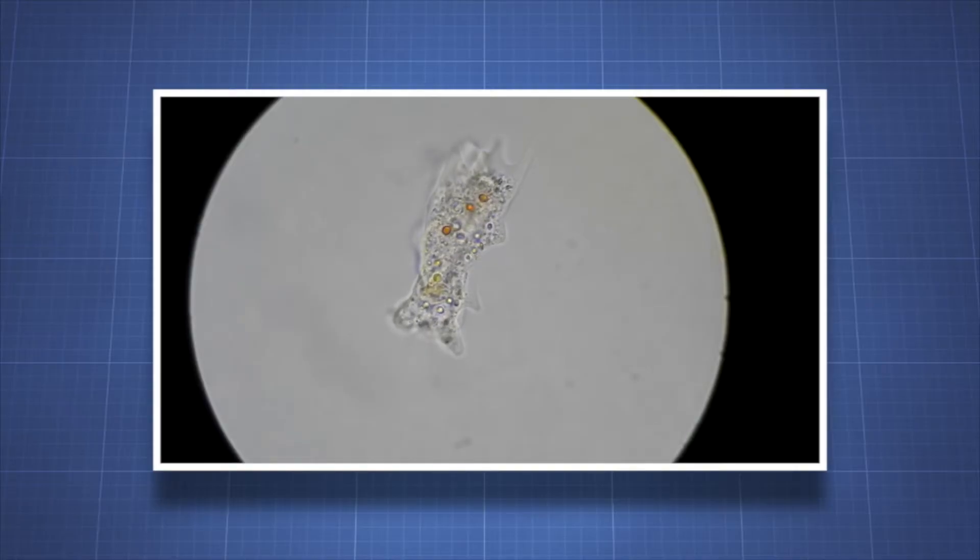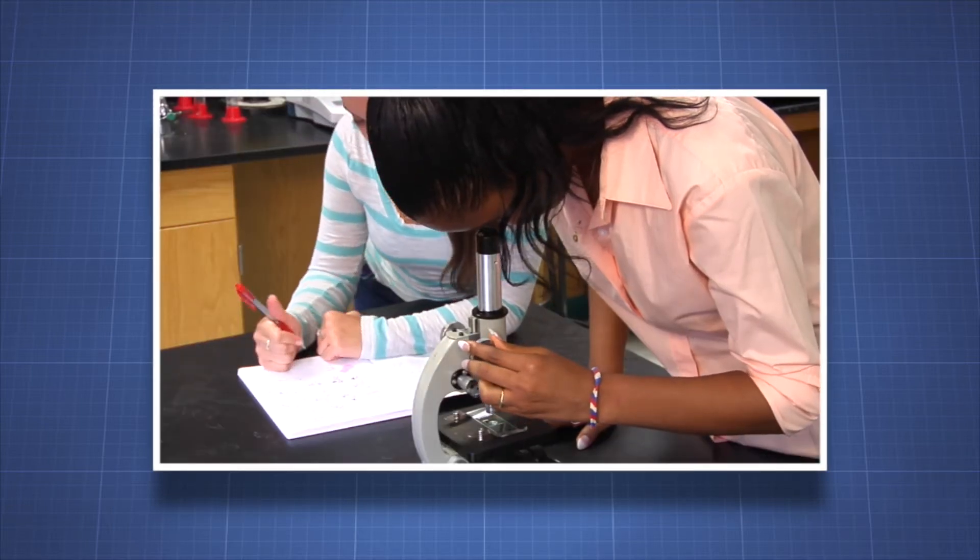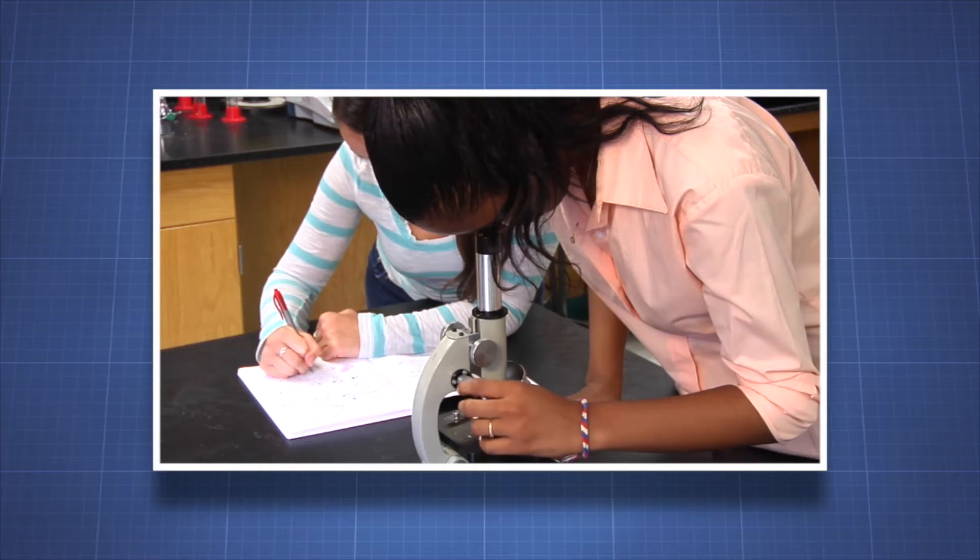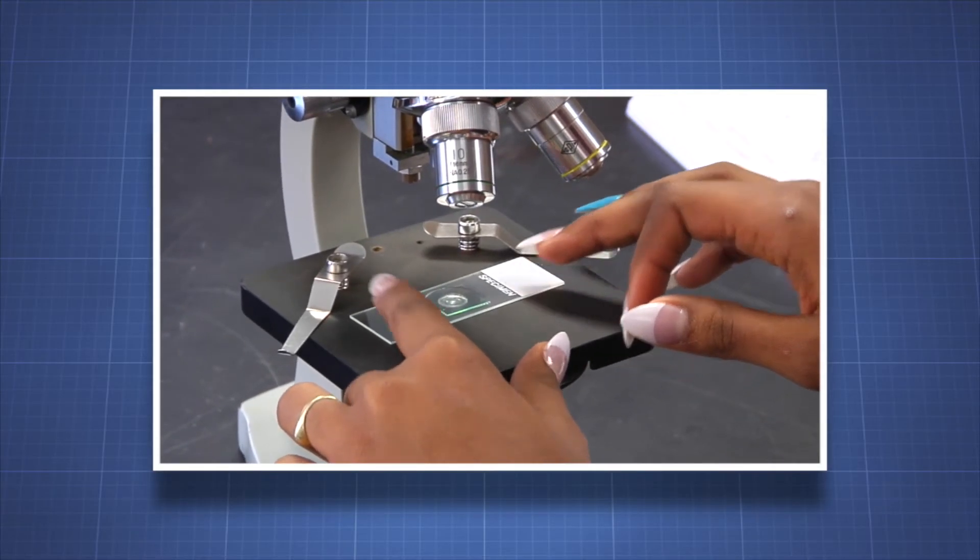Viewing tiny structures and microorganisms through a microscope gives a unique perspective on the world that is too small to see. When making scientific observations, your methods and observations must be clear to other scientists, so it is essential to prepare and observe a microscope slide correctly.